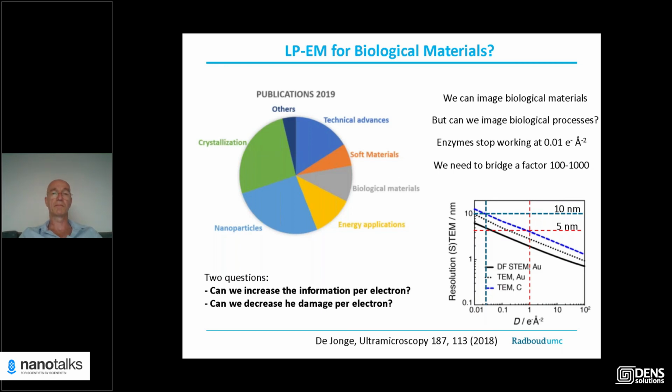We will now handle the last question from Barbara Malheiros from Brazil. And she asks, first of all, such a nice presentation. Very interesting work with liquid cell EM and beautiful applications. In this last project with the graphene that you've shown, how does it work experimentally to put the graphene sheets onto the chips? Does it have to be right before inserting the holder into the microscope, or can it be mounted and stored for a while?